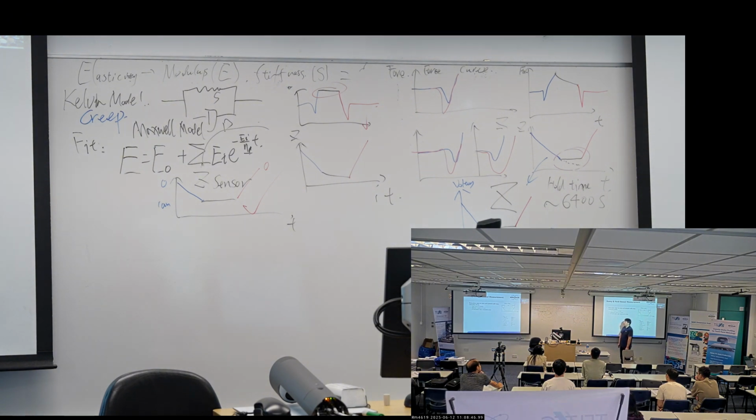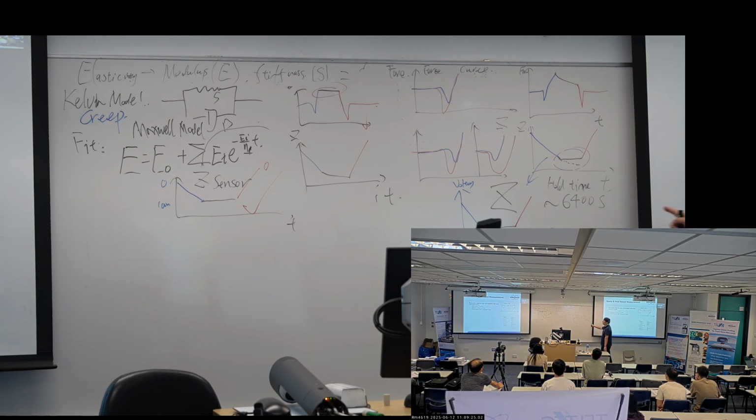So we would say for the AFMs, we cannot hold the deformation. I mean, we cannot keep the deformation as we do in macro scale experiments, because in the macro scale experiments, they compress the whole sample, so they can control the deformation. But for the AFM, as Dr. Ma said, we can only hold the position of the probe. As such, the deformation itself is changing.